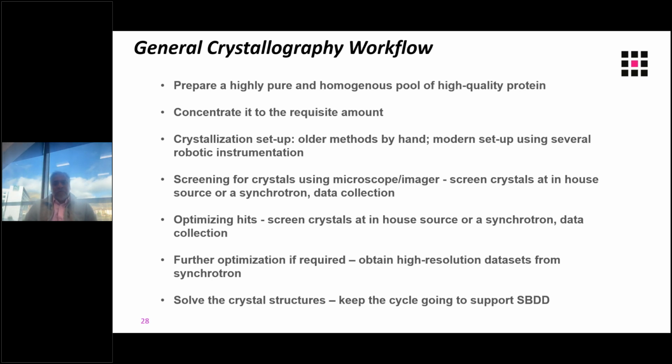And we need to be able to concentrate it sometimes to pretty high amounts. The traditional way to set up was to use older methods by hand. But in the last couple decades or more, we have been fortunate enough to use several robotic instruments to make this process more feasible and actually delve into more high throughput screening modalities.